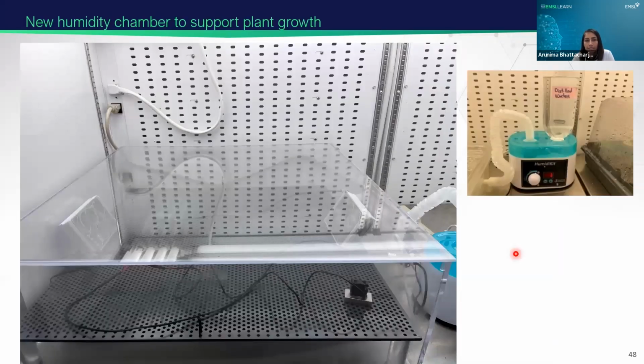We also have this humidity chamber setup to support the plant growth. When we were optimizing this plant growth in soil, we noticed that it would dry up pretty fast. So we built this setup, and this humidity chamber can fit a lot of these 96 well plates for plant growth. If a project requires, we can also create these SubTap rhizosphere platforms in larger formats, which accommodates plant growth for longer periods of time. In this case, we have been able to grow a plant for up to 4 weeks.